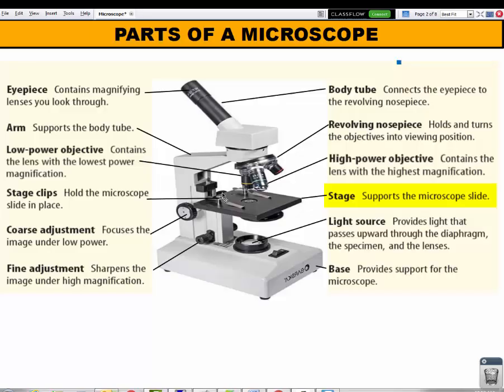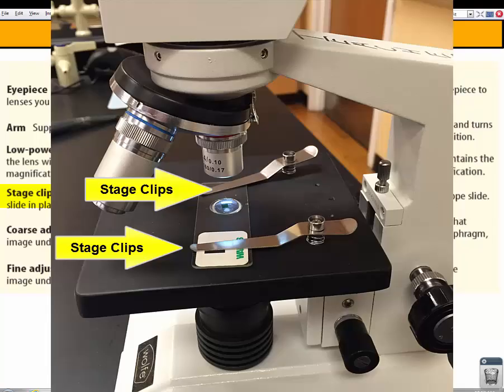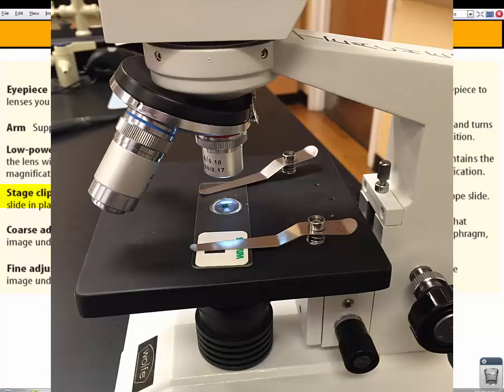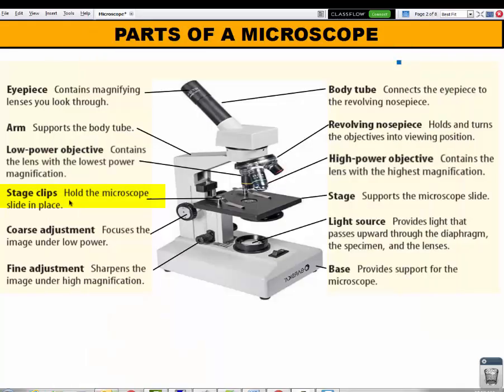To keep the slide stable on the stage, what we want to do is use stage clips. The stage clips will hold the slides in place, just as you can see in this picture here. Since the stage clips are on the slide, the slide won't easily move on the stage, thus you won't quickly lose the specimen that you're looking at.